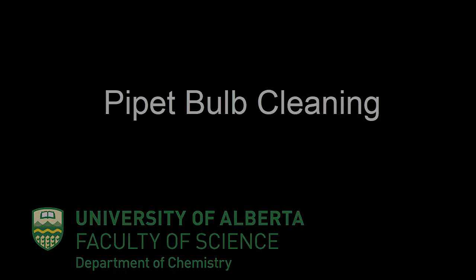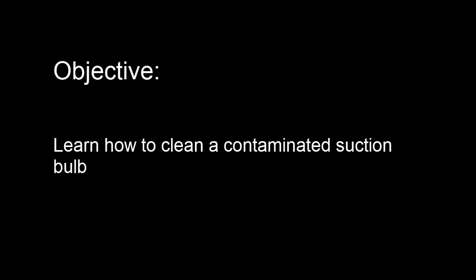Suction Bulb Cleaning. The objective of this video is to learn how to clean a contaminated suction bulb.